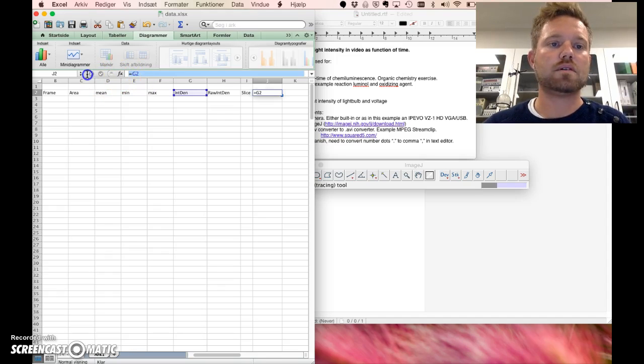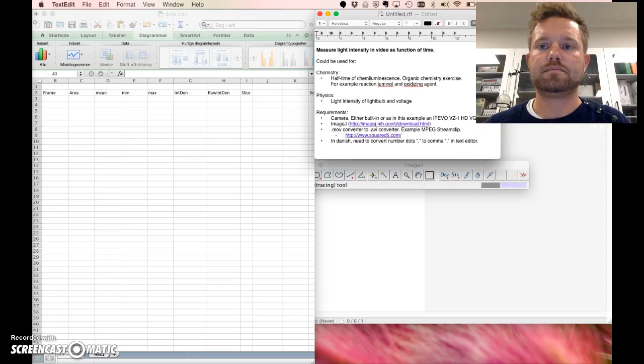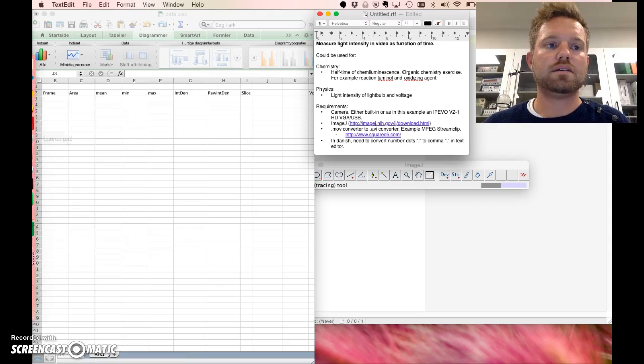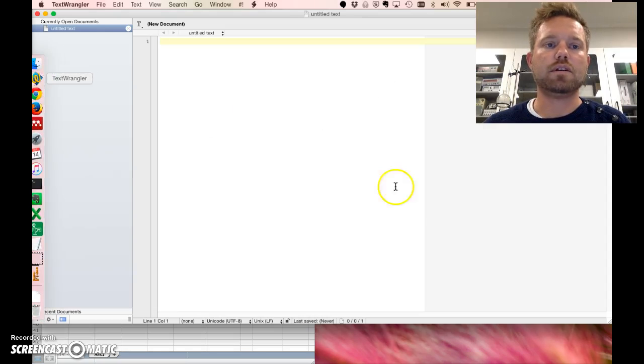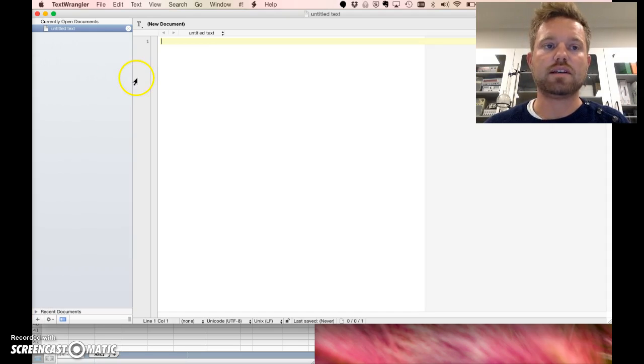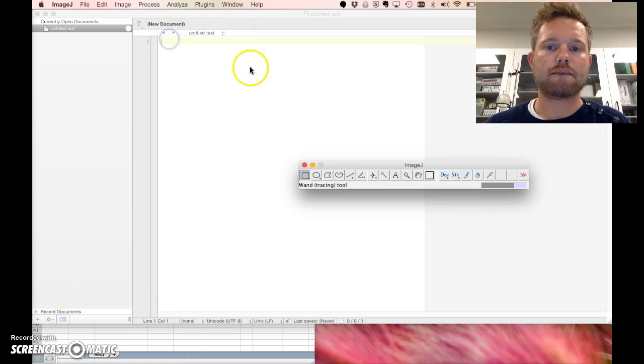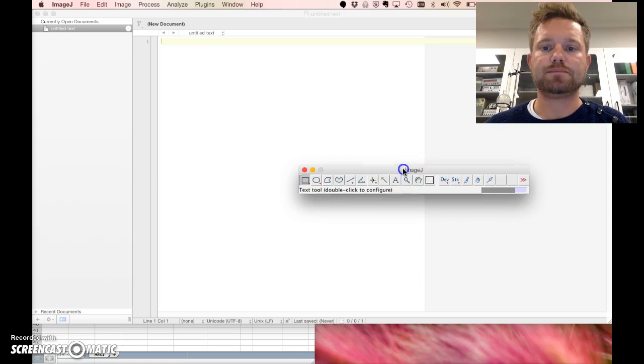As a text converter, I have just taken any text converter. This is Text Wrangler. You can find any. This is of course only relevant to Denmark if you need to convert dots to commas, but any converter will do. Let's see if it's done. Soon done.